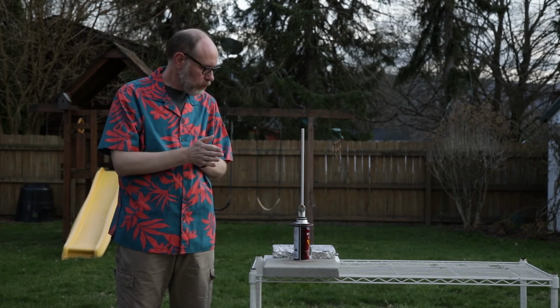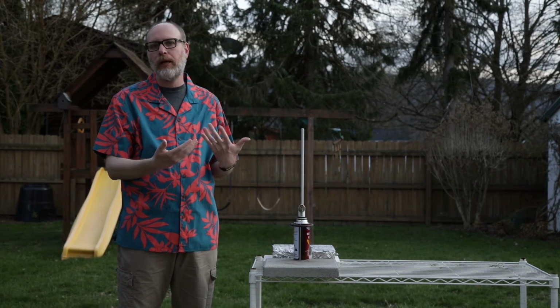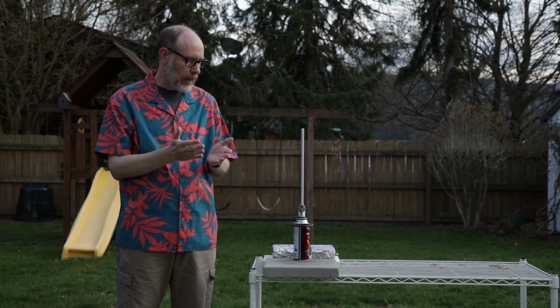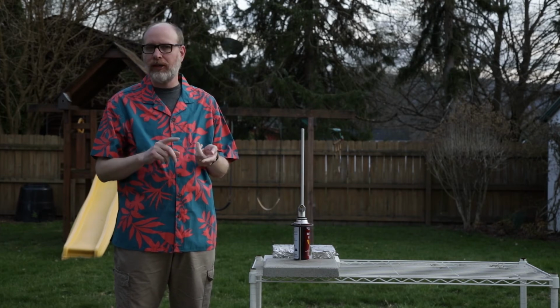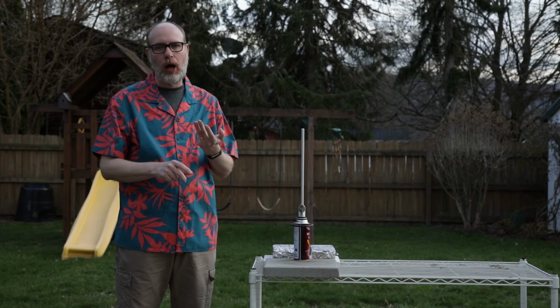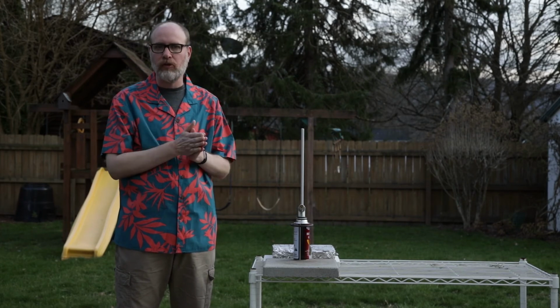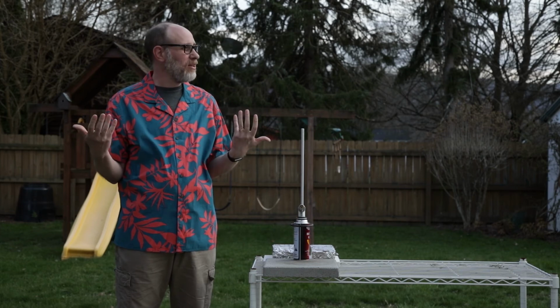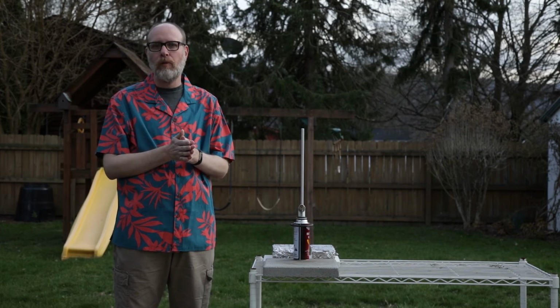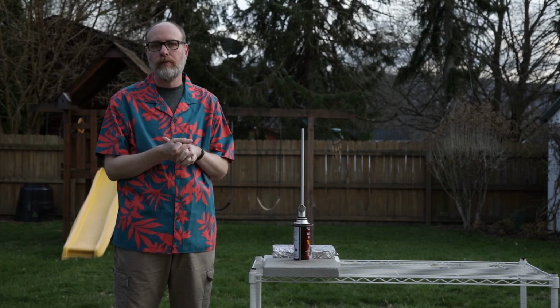And so we're going to see that, and the color that will be emitted will be dependent on the type of metal ion that we're going to use. So we're going to see things like strontium and potassium. We'll see boron in boric acid, and we'll get to see there will be different colors that will be emitted. So whenever it gets a little bit darker, we'll go ahead and do that. But for now, we'll just see you whenever it gets dark.